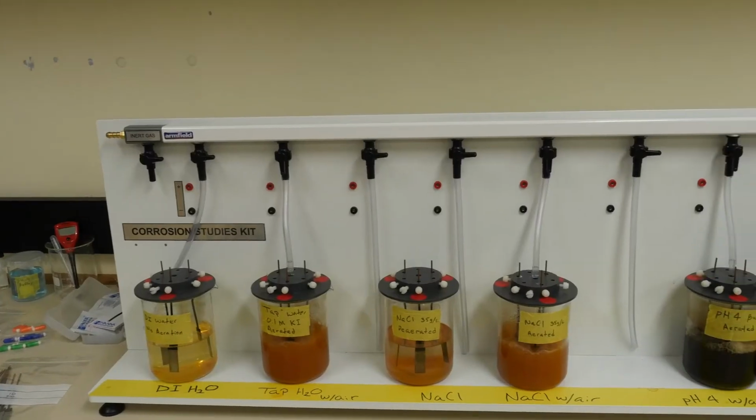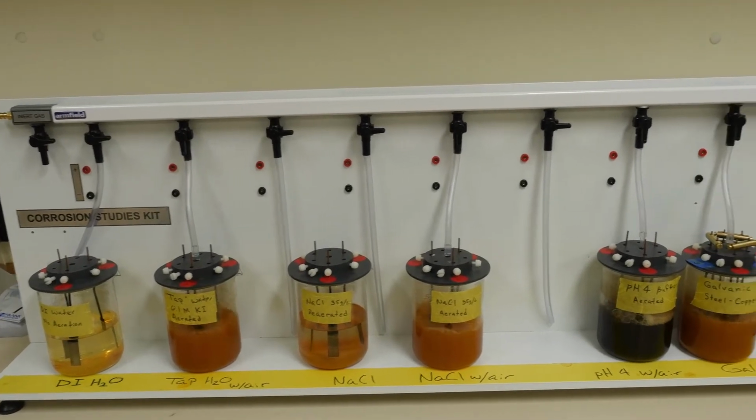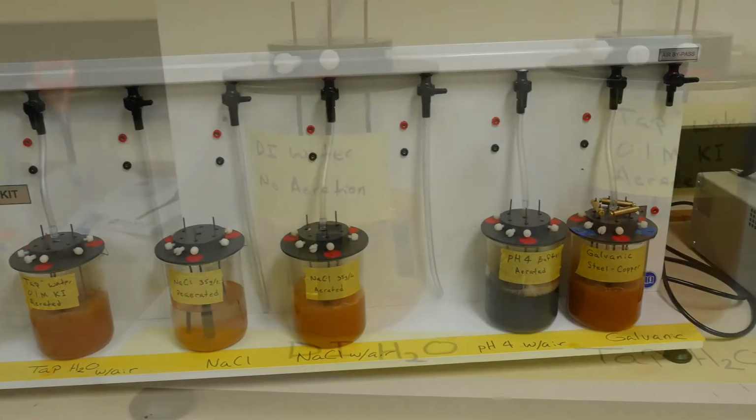This is the corrosion studies kit. Some of the corrosion cells are aerated. The sound you can hear is the air pump.